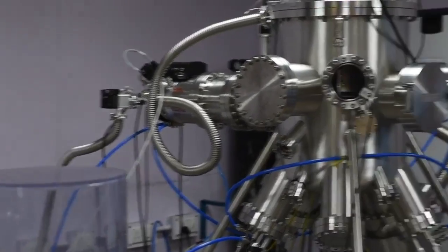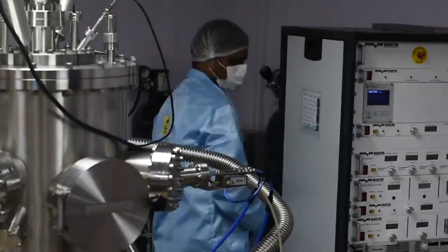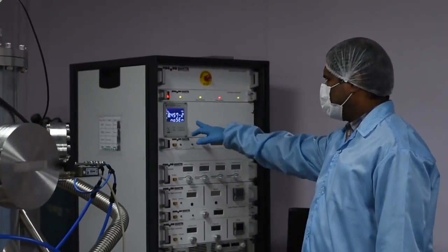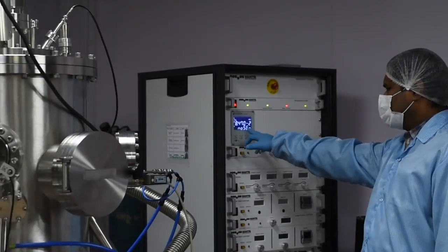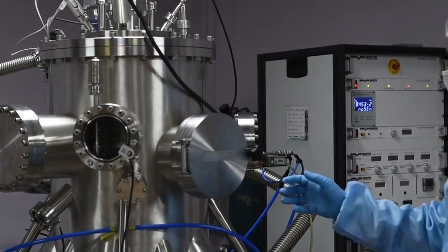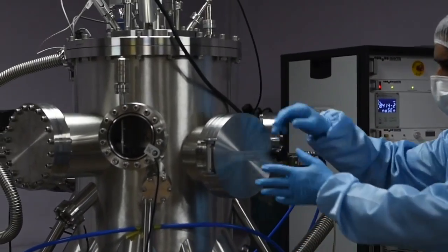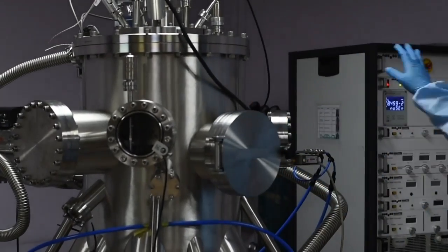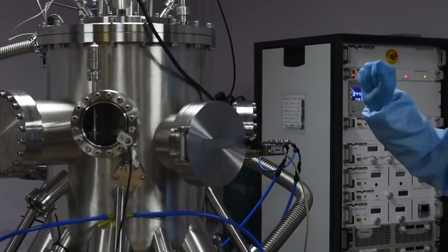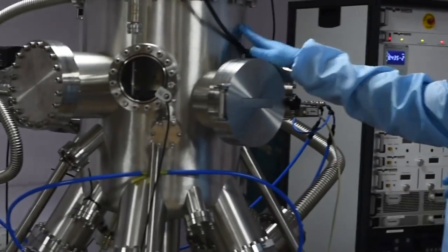The first step is to switch on the power supply. The vacuum chamber is currently in vacuum, and it should always be maintained in vacuum at around 10 to the power of minus 2 mbar. The first step is to load the target material that we want to sputter and to load the substrate. Since the chamber is in vacuum, we have to bring it to atmospheric pressure of 995 mbar by inserting very pure, dry nitrogen gas.